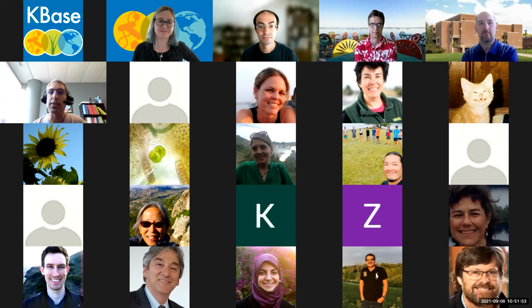Now that you got me all interested in metabolic models, let's look at the tools that we're using. So look at the info tab and now try to find the paper and why is this assembler different from the other assembler. And we started doing that last time we did this class, but I did not emphasize that enough. And I want to really try to have students discuss both in person this semester, hopefully, as well as on the discussion forums. Why did you pick these default parameters, or why is this tool different from the other? And using the resources that KBase has, as well as linking out to the original papers if possible.